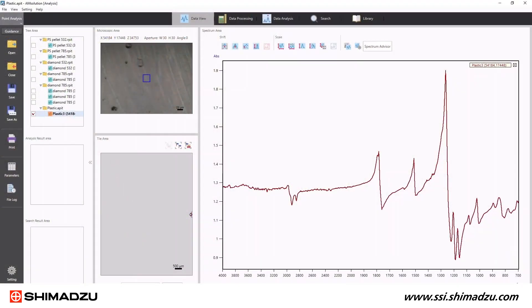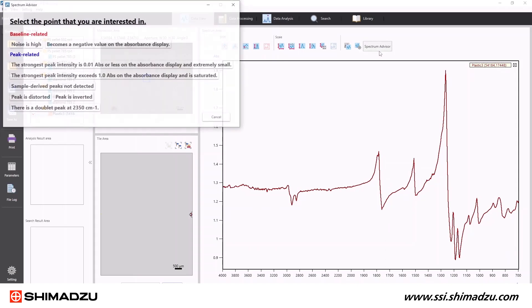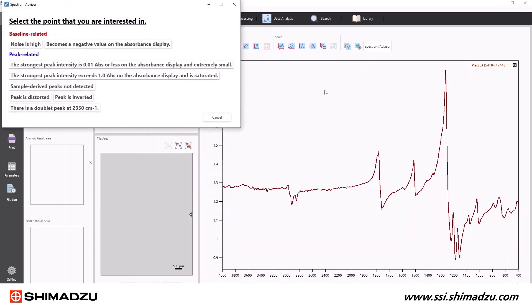FTIR and Raman spectroscopy are inherently sensitive techniques, especially on the micro scale. A seemingly small measurement parameter can make a spectrum look noisy or have peaks that look inverted. The AirSight's AM Solution software has a built-in patent-pending Spectrum Advisor program to help users troubleshoot their spectrum.